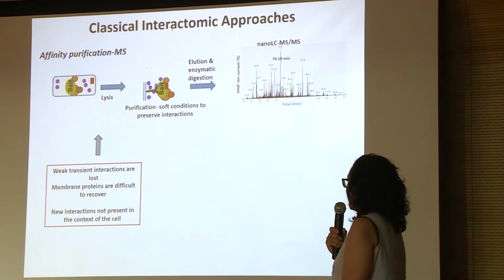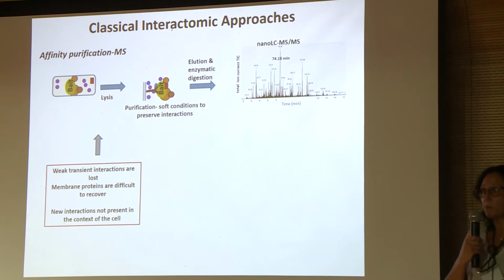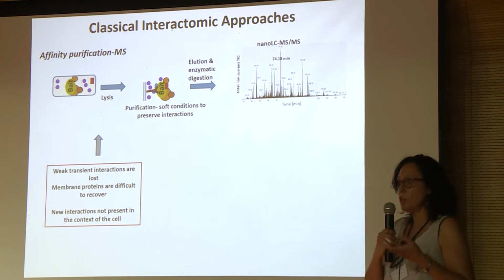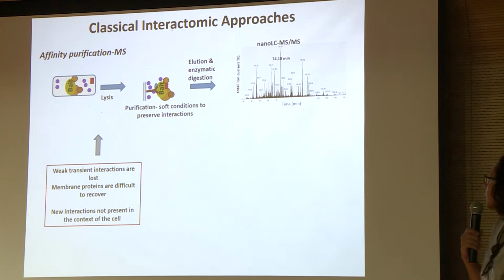And the other thing is that we have noise because there are new interactions that are going to be formed because we are putting together proteins that were not in the same place in the cell. So we are going to be forming new interactions that were not present in the context of the living cell. So these are some of the drawbacks of this method.